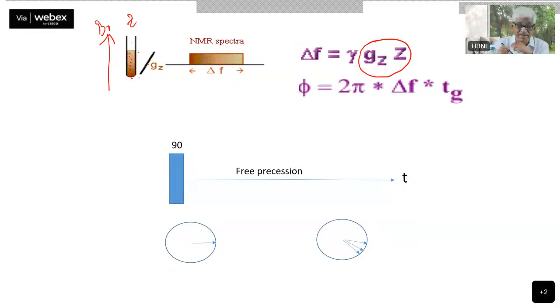That is why it leads to a spread in the frequency of this same signal, of the same water, or any other metabolite, any other signal you might have. It will lead to a spread in the frequency. This is called the dephasing, the dephasing of the particular signal due to the gradient. And that can vary. It is typically indicated as delta F. This much variation is there.